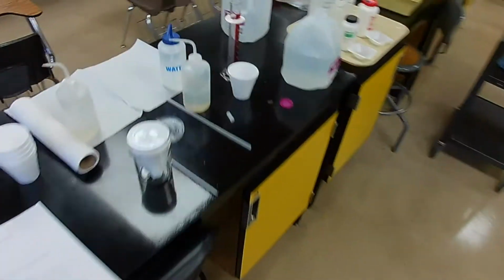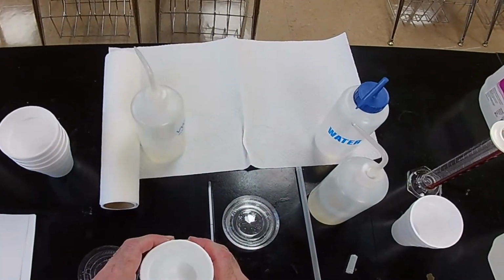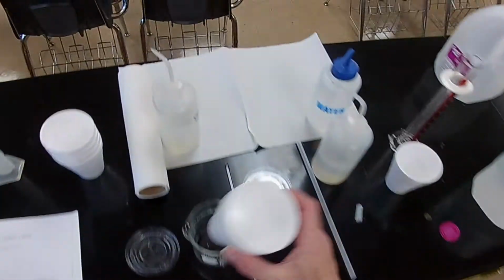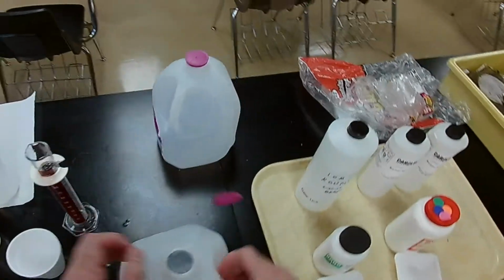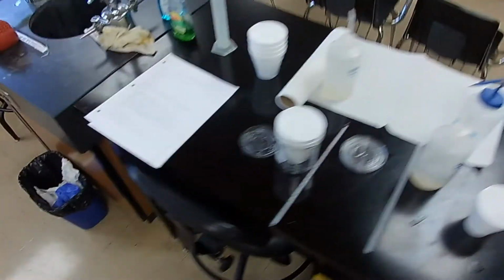Okay, we need to empty the calorimeter. This is distilled water. Go down the drain. And we're going to leave it open like that so it comes to room temperature before we start the rest of the experiments.